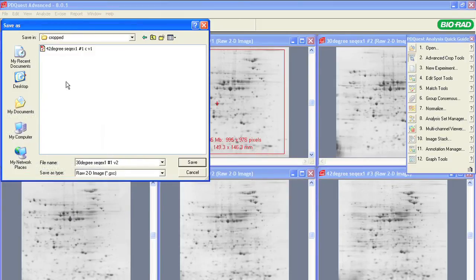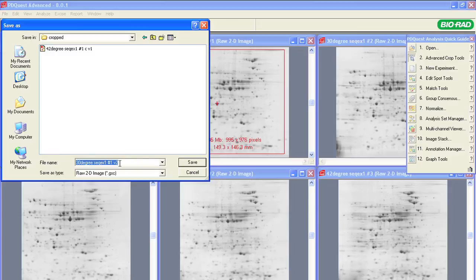When finished, we will have a stack of cropped images, all containing the protein spots of interest, and all will be the same size. Now, the images are ready for accurate detection and analysis of protein spots.